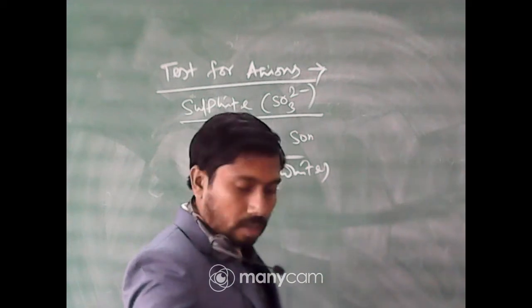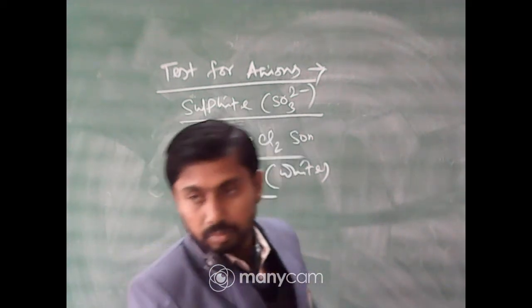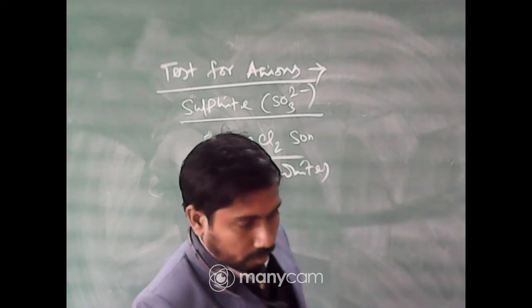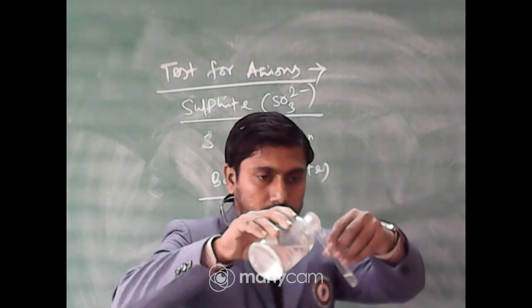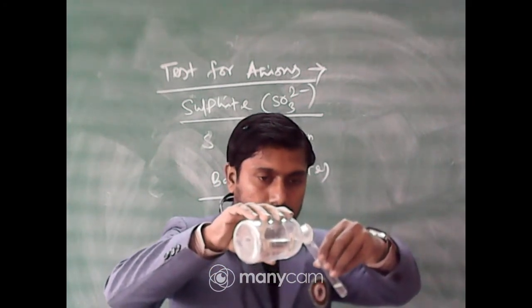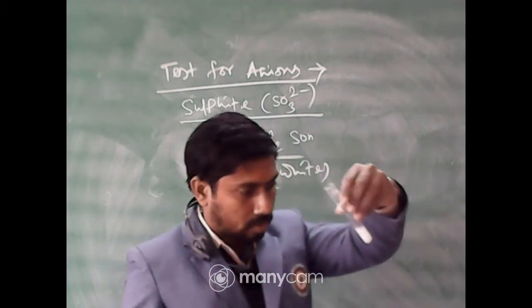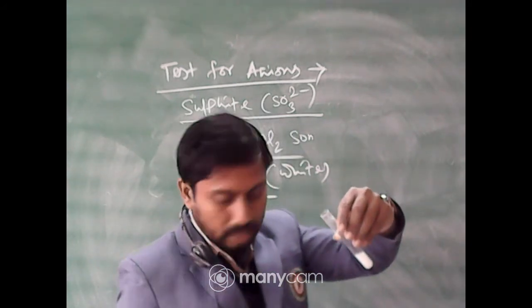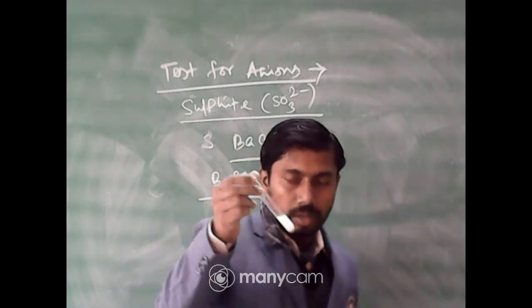When barium chloride is added here, just look at this, a very hardy PPT of white color is formed.